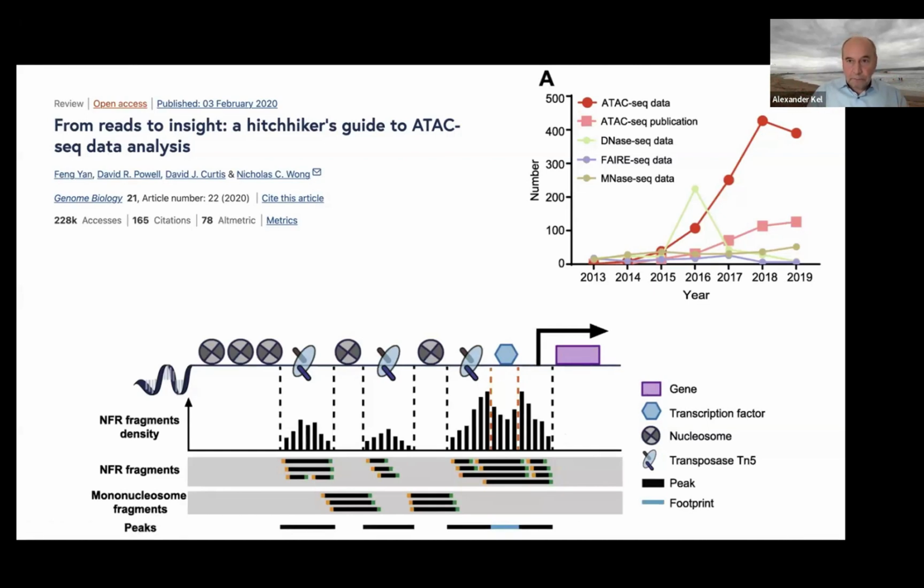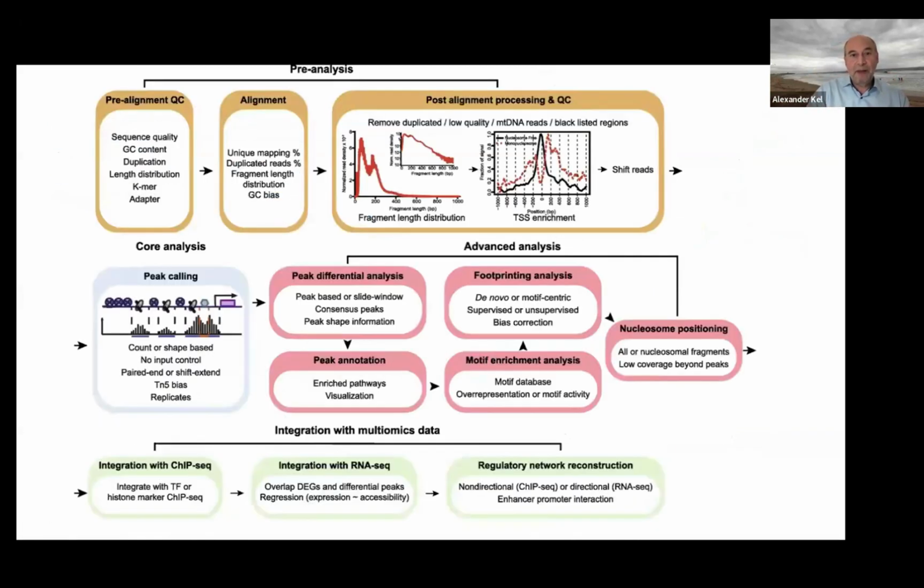And first of all, the question is: if there are transcription factors which regulate the activity of my gene, they might be binding to the areas of chromatin which are open. So those are the exact places where we should search for the motifs for transcription factor binding. There are a number of methods available now on the internet or in different packages, starting from the very beginning.